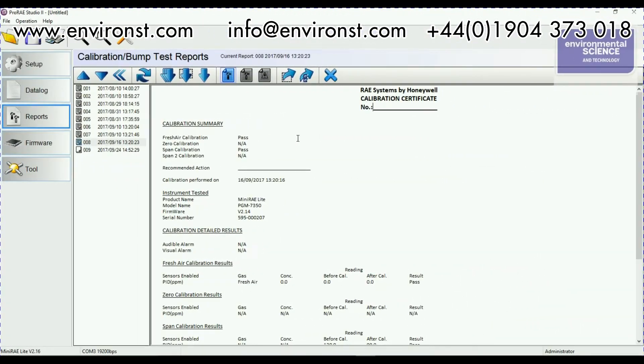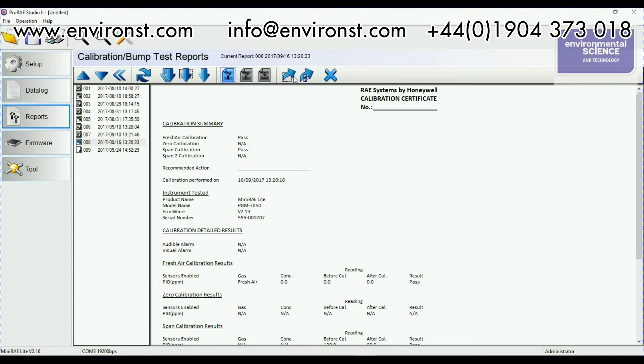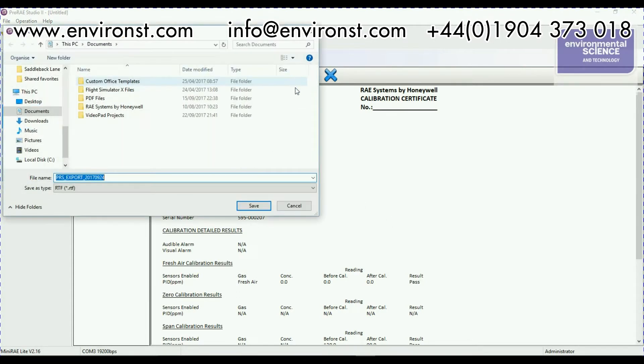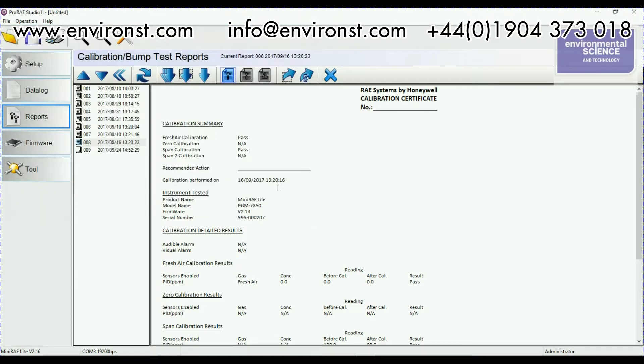Yet again if I want to export this I've got my two export options here. So here I can export a calibration certificate, a bump test certificate or a violation report. We're not going to bother with that. Or we can just go as a straight rich text format download.